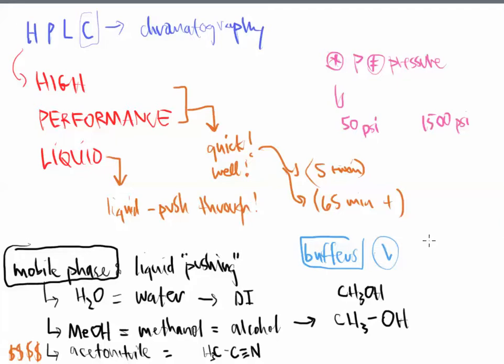If the components are acidic or basic in nature, meaning they give up or accept protons, then very often a buffer is required in the mobile phase prep, because we don't want these compounds to kick off or gain hydrogen whenever they want. We want them to be at equilibrium. We want them to be stable. So a buffer is sometimes required for that process. But there are others out there. It doesn't have to be limited to these 4.